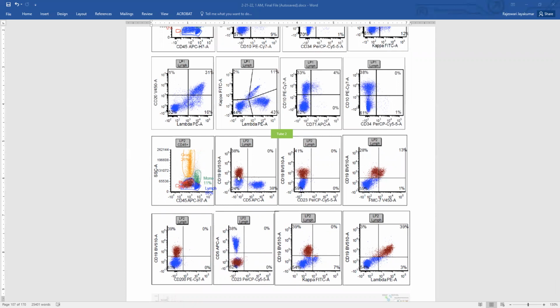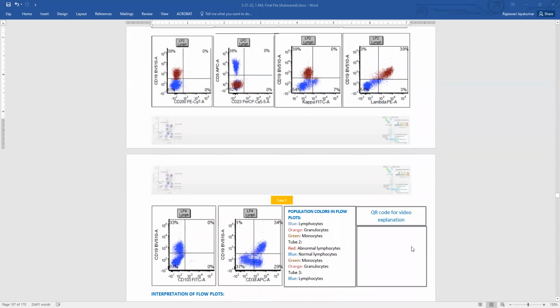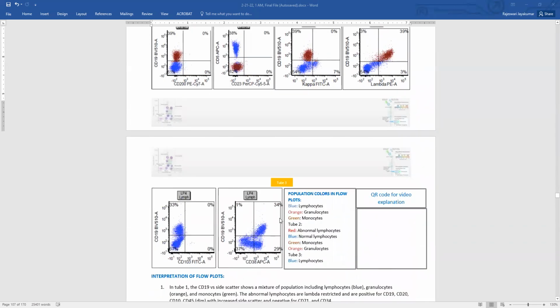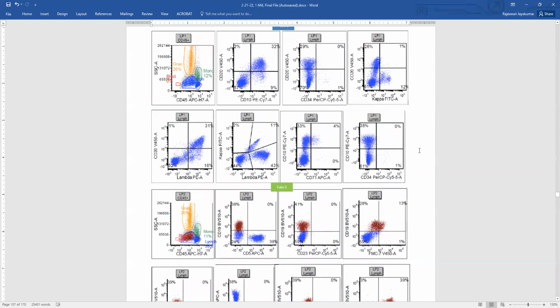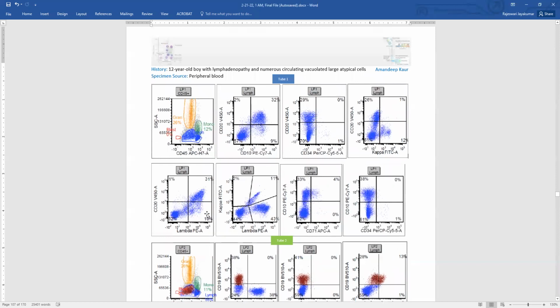Our B cells are negative for CD5. They are negative for CD23. They have partial FMC7. They're negative for CD200, negative for CD23 and CD5 again, and they are all lambda restricted. And they do express CD38, pretty homogeneous. They're negative for the hairy cell marker CD103. So we have a B cell lymphoma, which is lambda restricted.